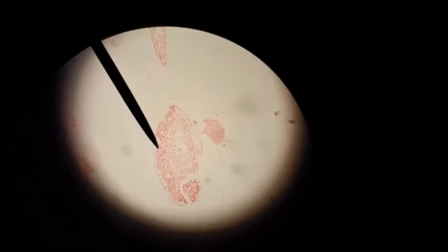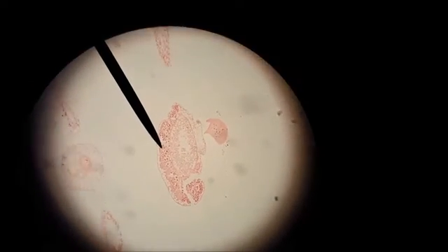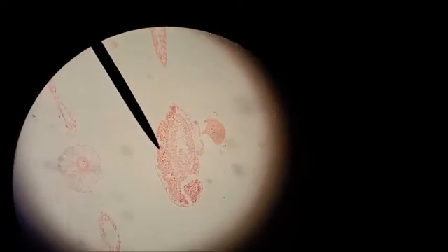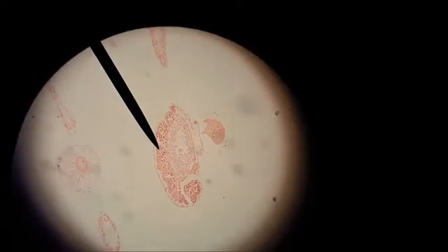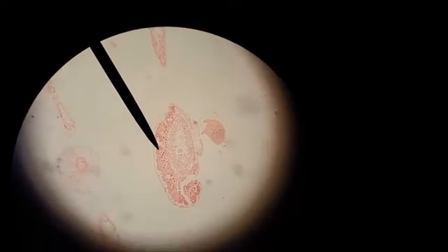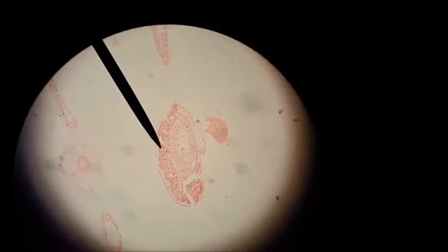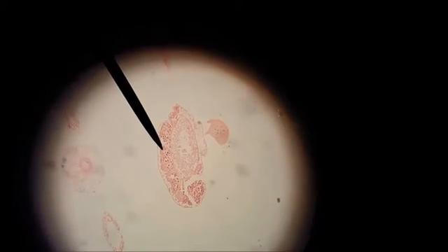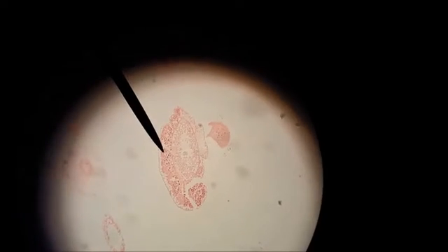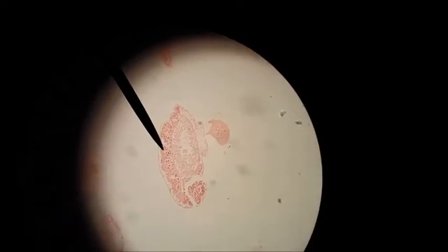This is a cross section through Hydra, and my guess is that the pointer is either on ovary material with eggs or testes material, most likely ovarian. Usually the eggs are larger and more dominant in these lower critters, pretty prominent inside.